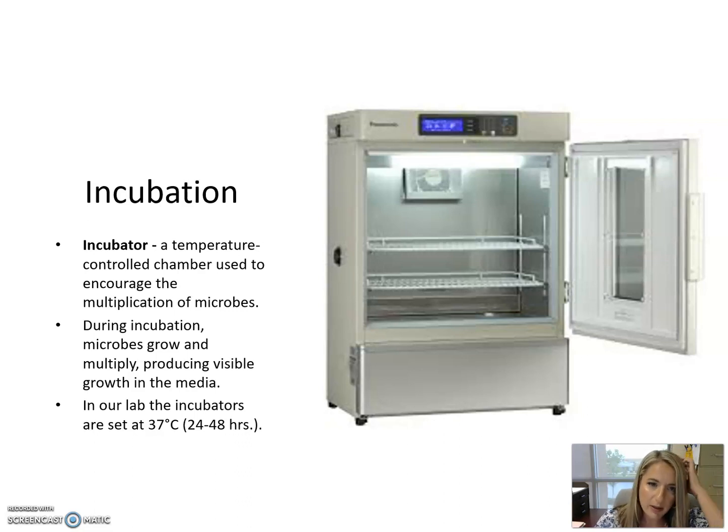Typically with microorganisms, most tend to grow well at about 37 degrees Celsius, which is comparable to 98 degrees Fahrenheit, which is our internal body temperature. If you let them grow at room temperature, they'll grow, but it's usually very slowly. To encourage growth at a fast rate within 24 to 48 hours, we will typically put them in the incubator at 37 degrees Celsius, and with that temperature, we will have an abundance of growth within 24 to 48 hours.